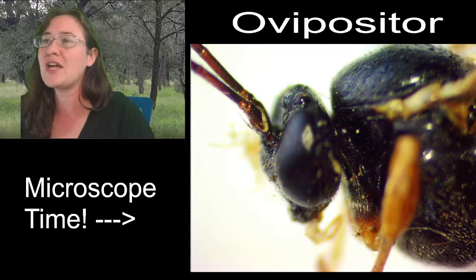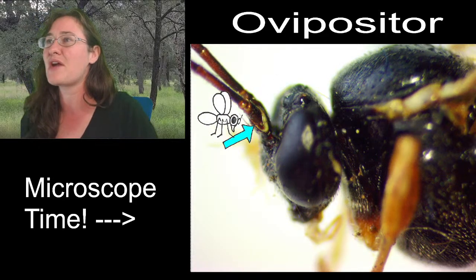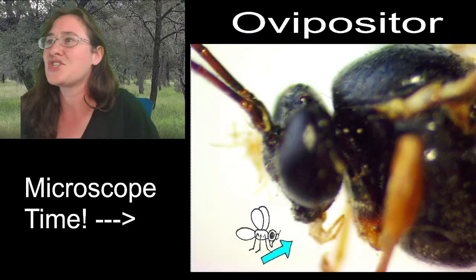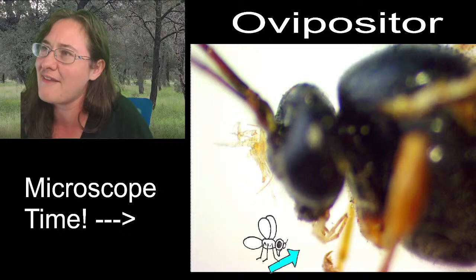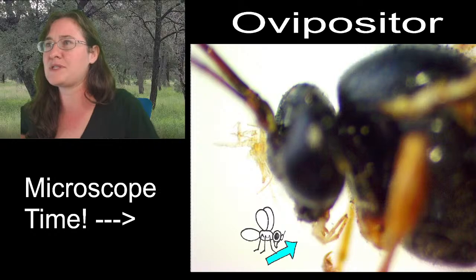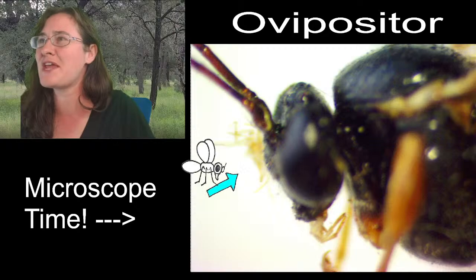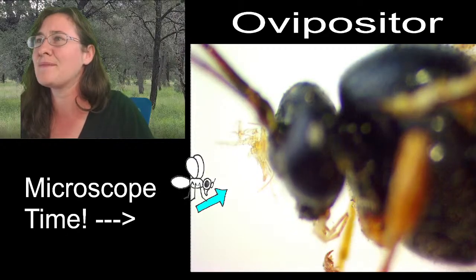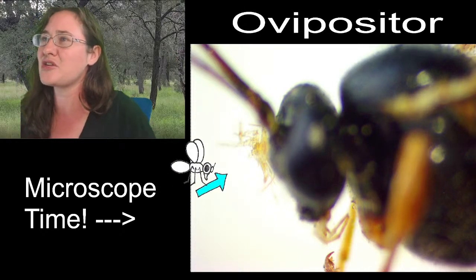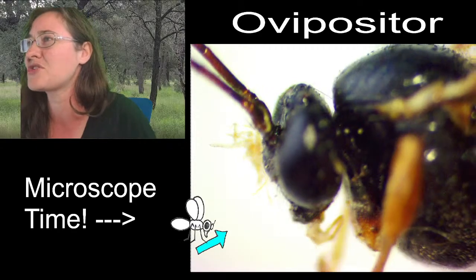She does have three ocelli up here on the top of her head in that triangular shape that we see regularly. So one, two, three little ocelli. And if we look all the way down here, she has pale, almost yellow or beige colored mouth parts. Those are labial palps. And she's got something hanging out right here on her head, and I'm not sure what exactly that would have been. It almost looks like she just has a little bit of dust on her, but it's the same color as her labial palps, so I'm not sure.